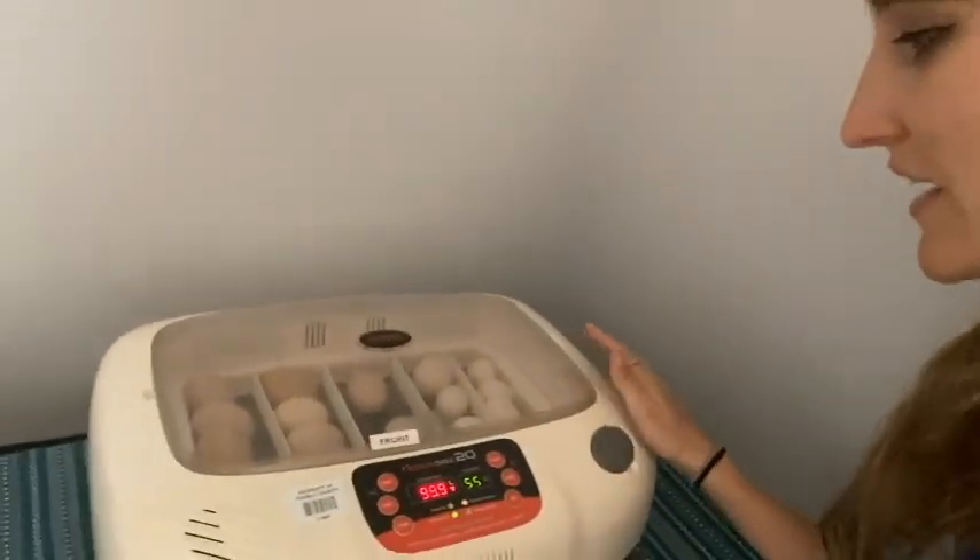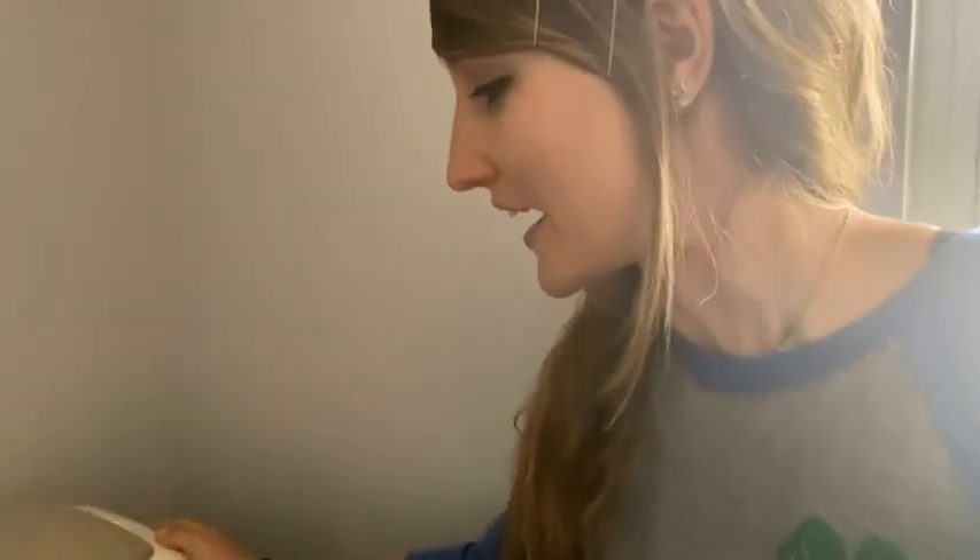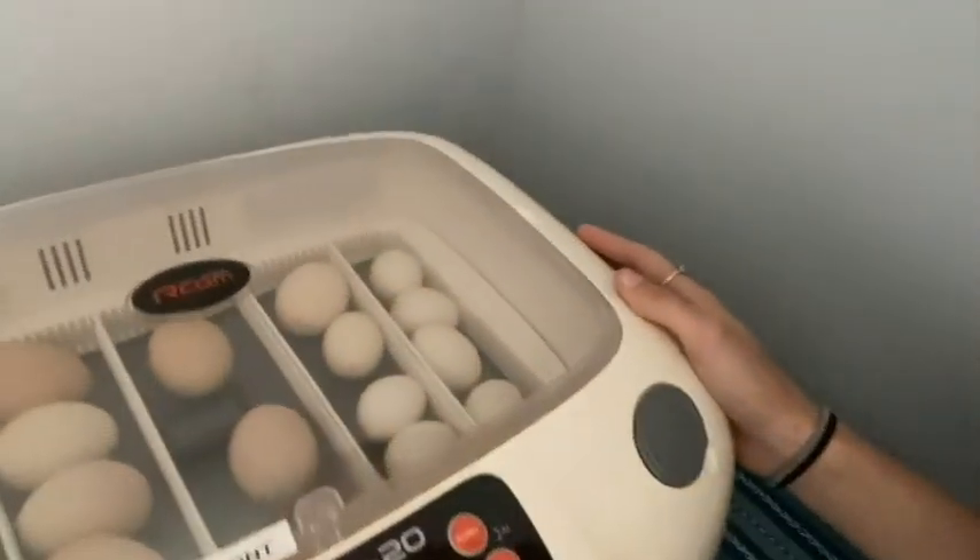So after candling all 18 eggs, it looks like we have 17 viable out of the 18, which is really, really high. That means we saw signs of life in 17 out of the 18 eggs, which is really, really exciting. We will check in again on day 18.